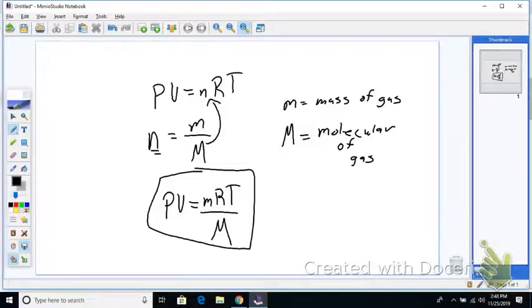So, methyl alcohol is being used. So methyl alcohol was placed in here. Okay? And it was heated up to boiling water, which is 99.5. It won't boil at 100 because we're at higher altitude. So you'll have to use a thermometer to measure the water's temperature. It should be around 98, 99, but maybe a half a degree here or there is probably not going to have a big effect on our calculation. All right, the pressure in the room was 738, a little higher altitude, so it's a little bit less.